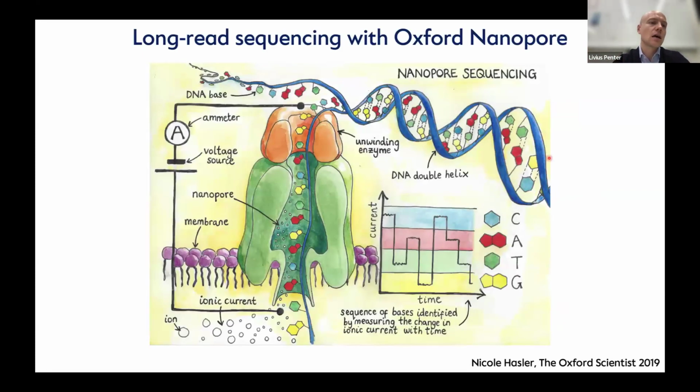And here we got interested in long-read sequencing. This is a novel sequencing technology, and Oxford Nanopore Technologies has one platform for long-read sequencing. And the principle is presented here, where you feed a DNA strand through a pore, and as it goes through the pore, it induces differences in an electric current. And as you record those changes in electric current, you can actually detect the DNA sequence.